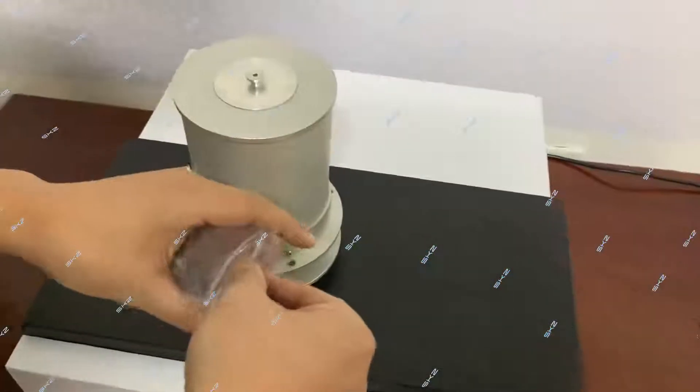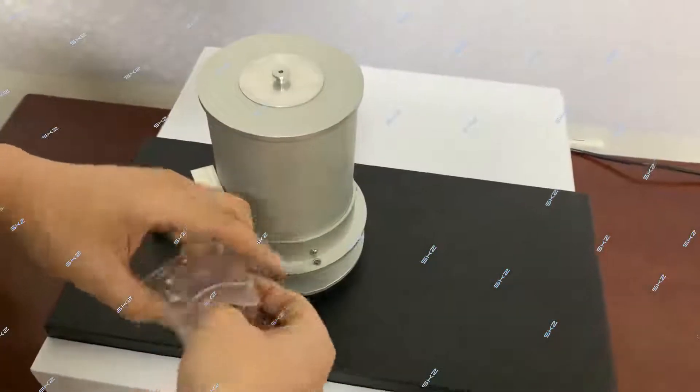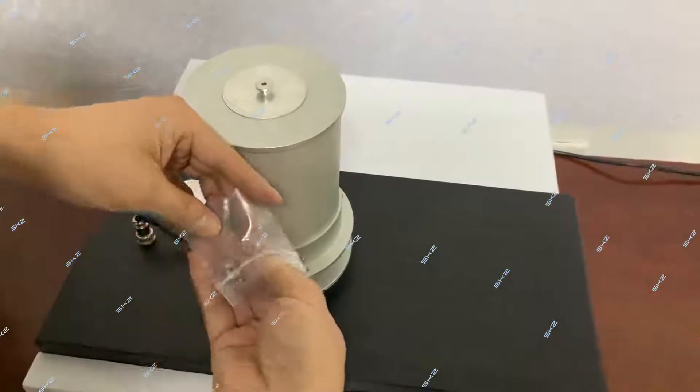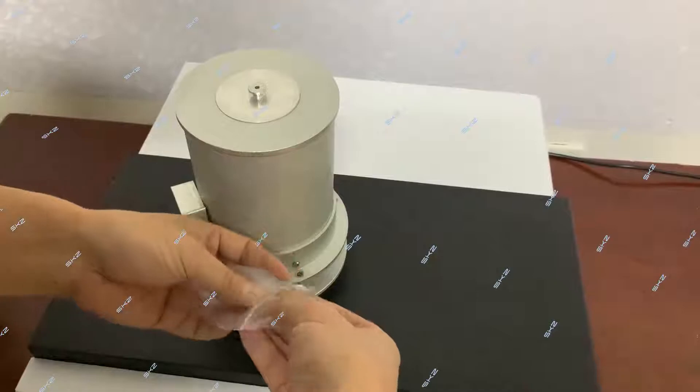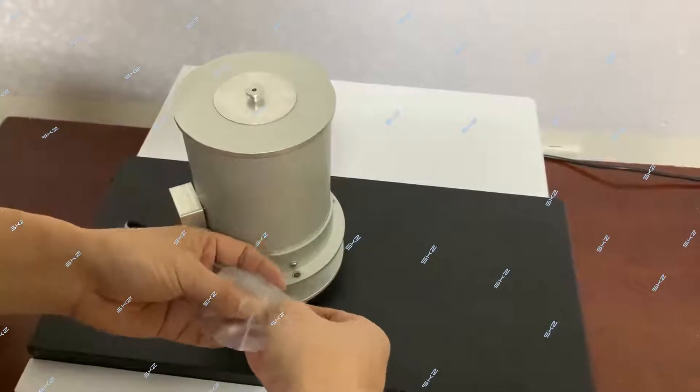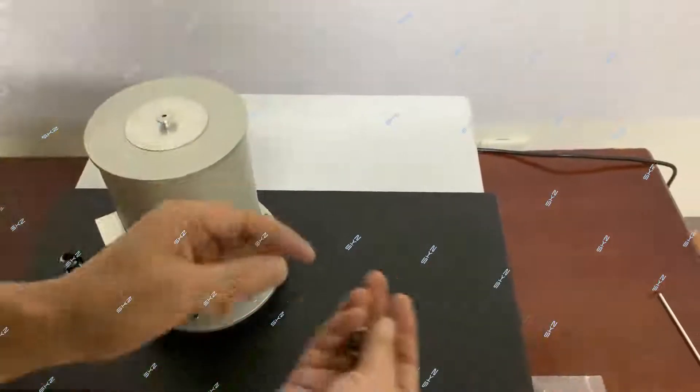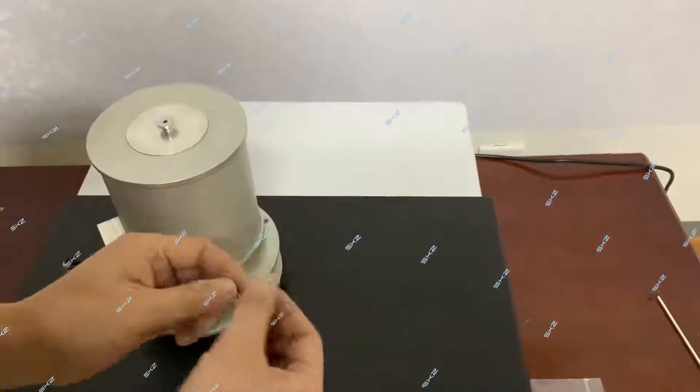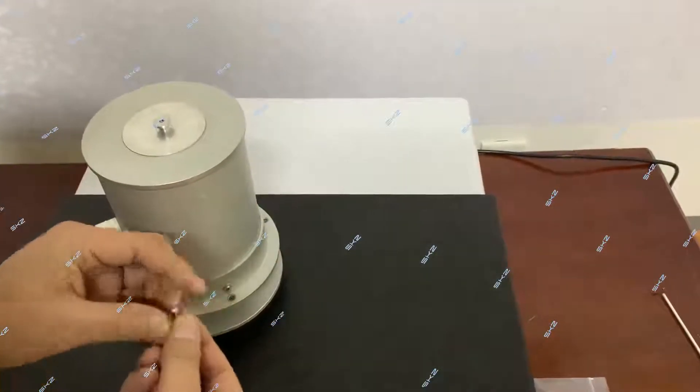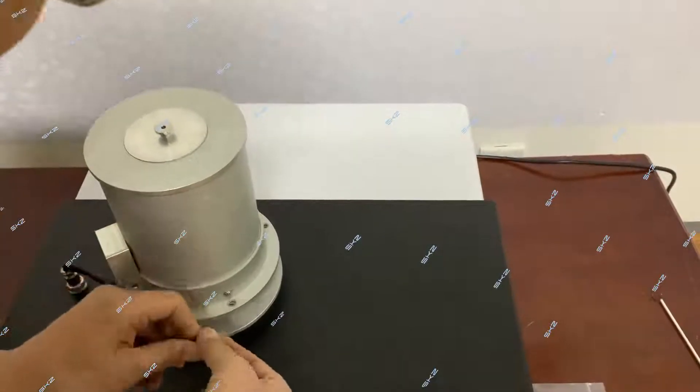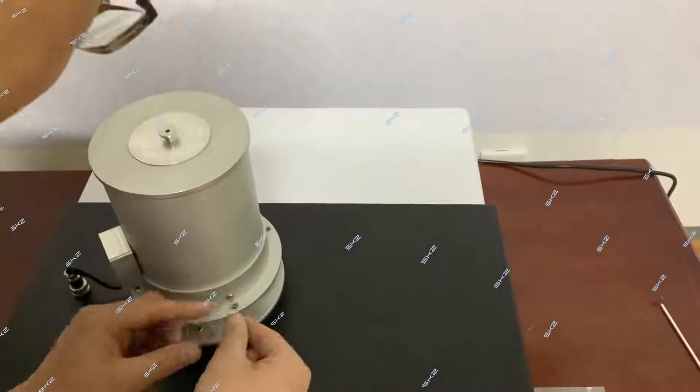At the beginning, no need to make it tightly, just make it a little. Then after we fix the sensor, you can make it tightly.